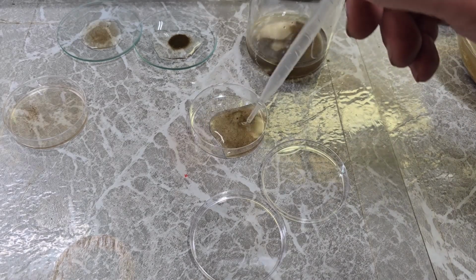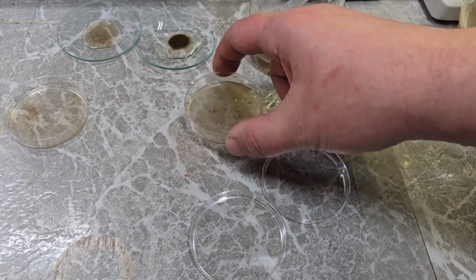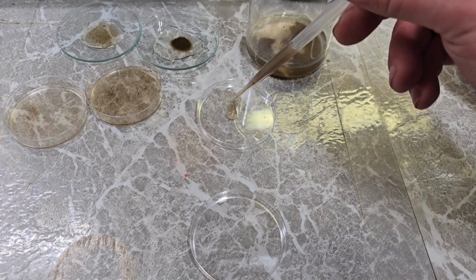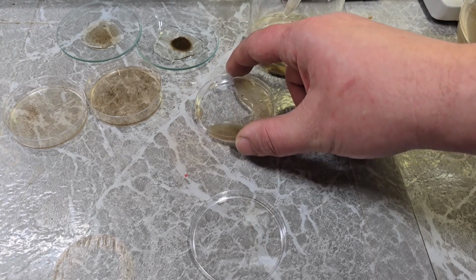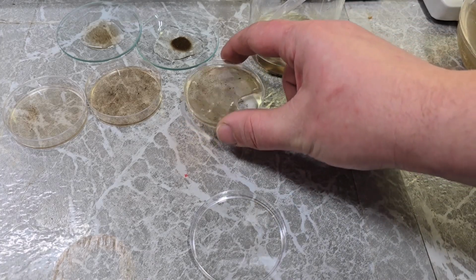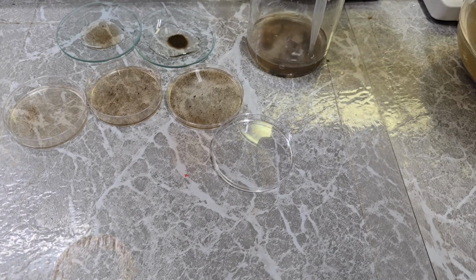Get just enough in here to make a nice even layer across the whole bottom that's not too thick. Hopefully the surface tension of the water will stick to the edge of the Petri dish, and then we can have a nice thin layer on the whole bottom surface. These polystyrene Petri dishes are relatively hydrophobic. It's kind of cool to see this water run away from the plastic the way it does. There we go. The more surface area we have to look at, the better chances we have of finding something worth watching.